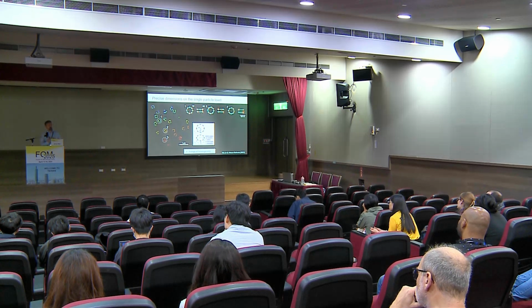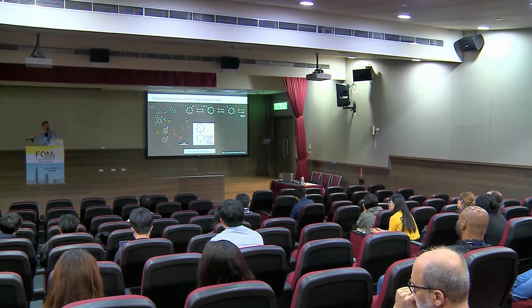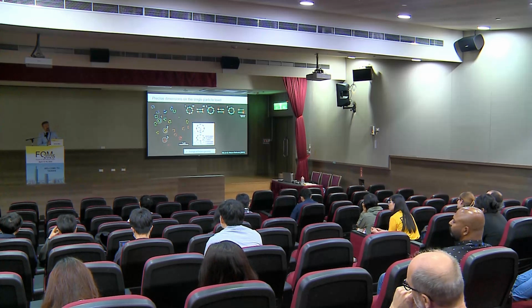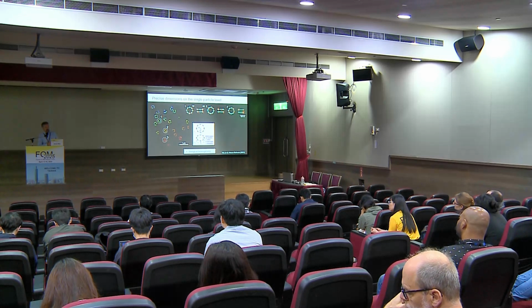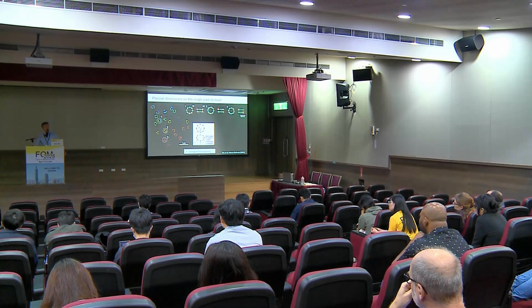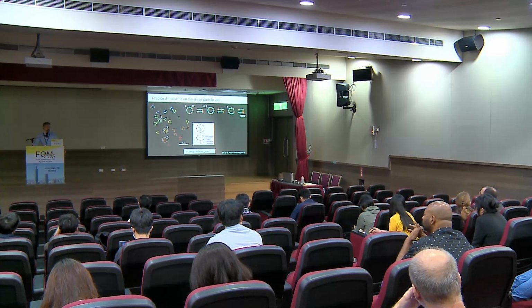I'm not even sure if we are at the limit where the fluorophore gets close to the brighter rim of the donut, since we are so much more photon efficient compared to camera-based tracking. So it could well be that at some point, and this again one has to look at, one doesn't gain using MINFLUX because one cannot keep the fluorophore close to the center. One doesn't have this great resolution enhancement. It's something to really look at, and if you're in this regime, then maybe camera-based tracking is the way to go.